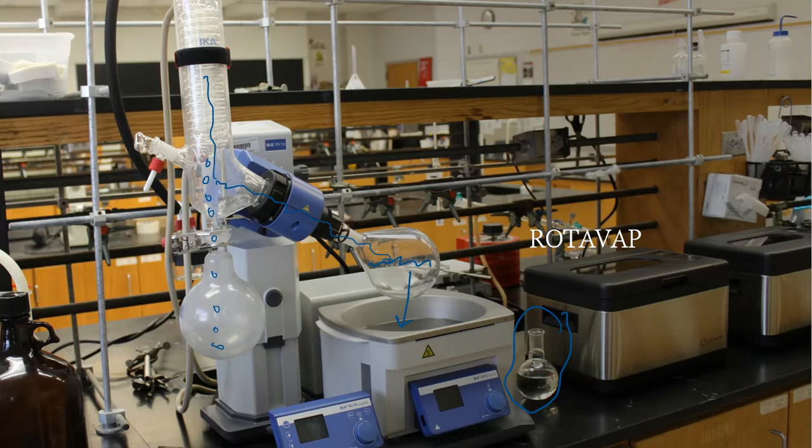All right, so there's my rotovap. I need to take this big chunky flask off of here, and I'm going to replace it with my Florence flask that's right there. I'm just going to attach the clip so that it doesn't go anywhere. And then I'll start this heating process up.